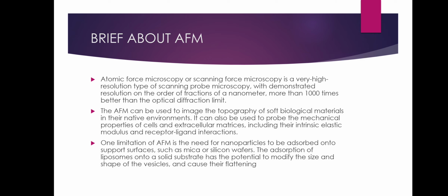A brief about atomic force microscopy. Atomic force microscopy is a type of scanning probe microscopy which demonstrates the sample in a fraction of a nanometer, which is 1000 times better than the optical diffraction limit.